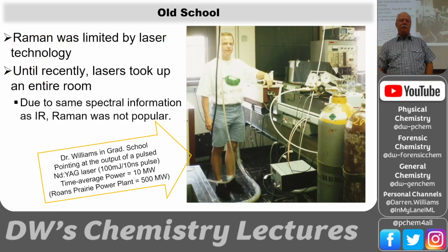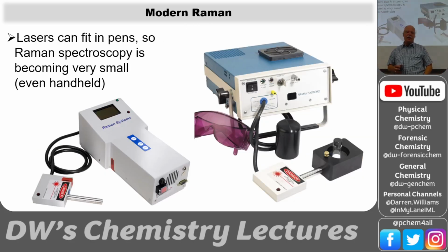It was not very popular because it was really expensive and bulky. But this is the Raman spectrometer I used in grad school. So that's me with my Texas jalapeno shirt on. Okay. And that was the laser right there, and the power supply was over here. It's about the size of a washing machine. Okay. And so it was big and bulky, not very useful for forensic analysis.